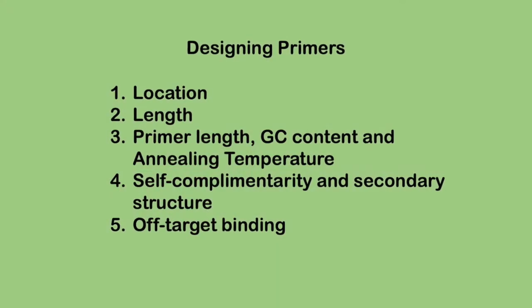Now, obviously, the flip side's true. It could be useful for generating the abundance of the specific splice isoforms.